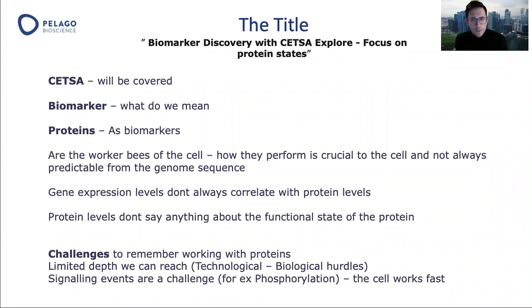The ideal biomarker for keeping track of the efficacy of a drug is probably the target protein itself, if the target and the drug mechanism has been properly evaluated, of course. The drug target is, in fact, the closest in proximity if you want to grip on efficacy. And the phenotypic effect is then down the line and can be diluted, so to say. However, very few drugs hit just one protein. So for a full understanding of a mechanism of a drug, you probably need to study more than just the target itself, just to get a feeling of unwanted side effects and so on.